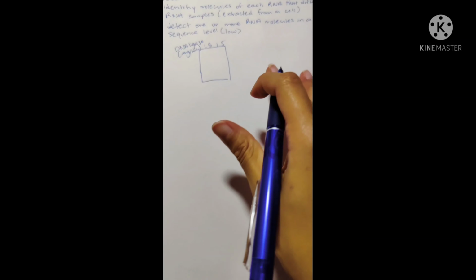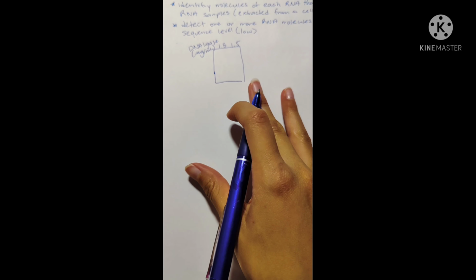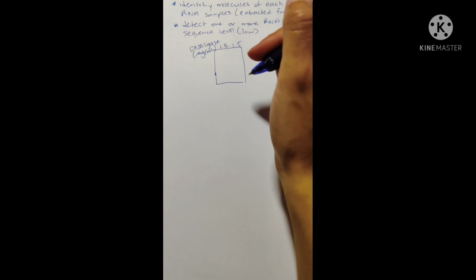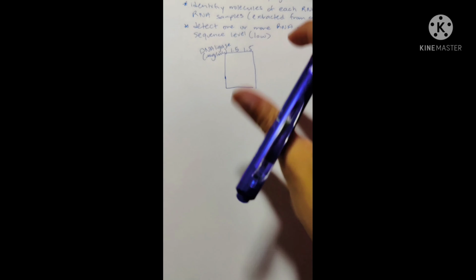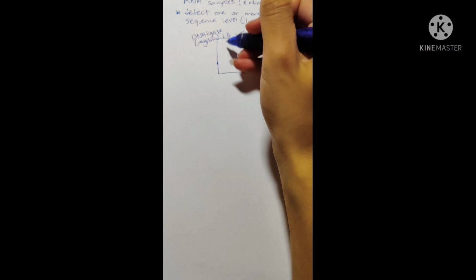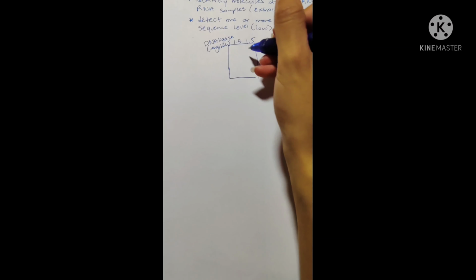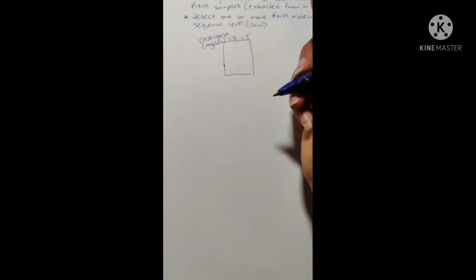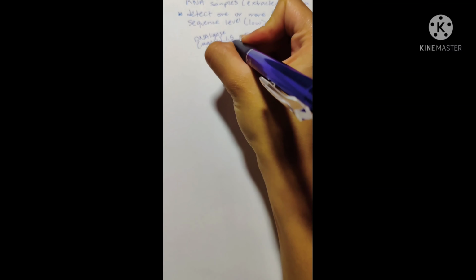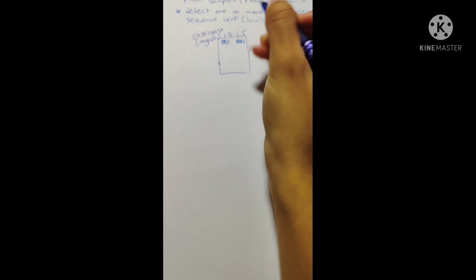In this case, we will be looking at the neurons that are present in the hypothalamus. So this area would represent the hypothalamus cell, and this area here would represent the red blood cell. Pretty much you'd have your little indication for each one.